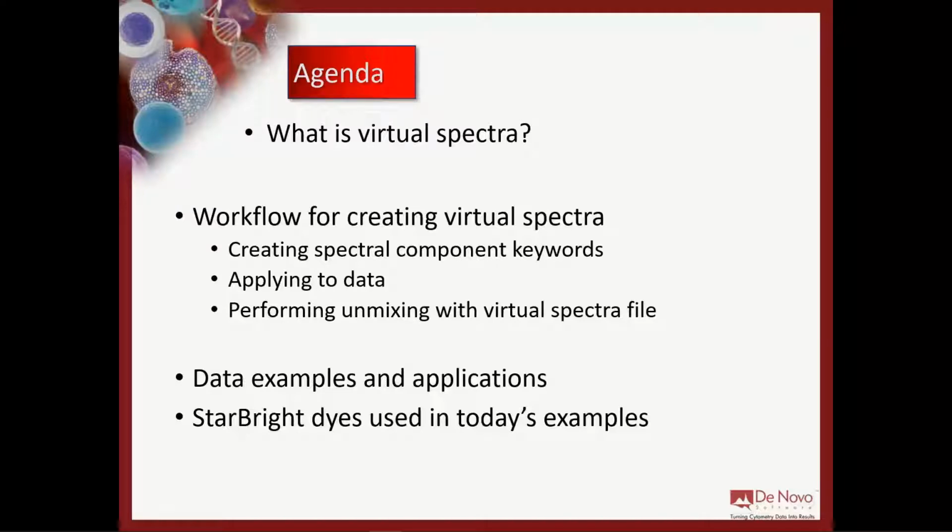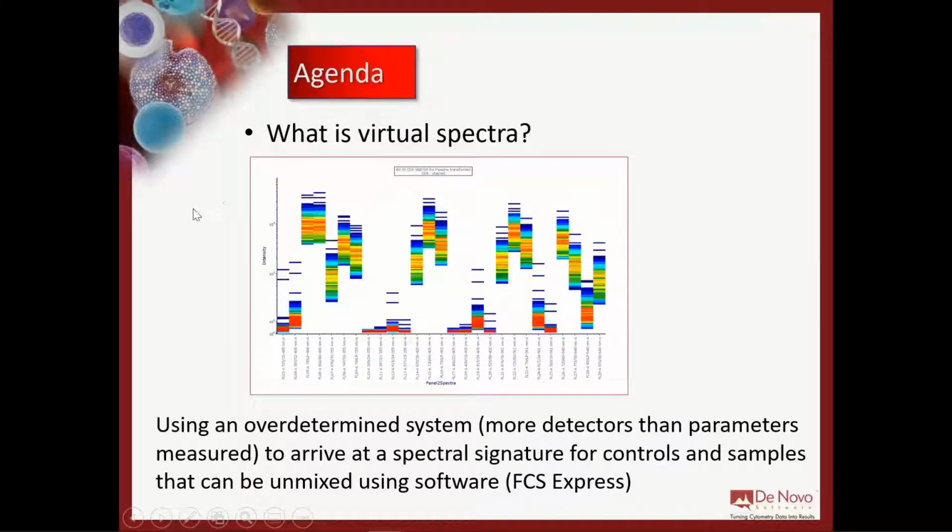We're going to follow on to that. We'll show you one or two data examples and applications of using this technology and this workflow. And we're also going to discuss very shortly, just in about 4 or 5 minutes toward the end, the Starbright dyes from Biorad that were used in today's examples. I'll come back and talk about that as well.